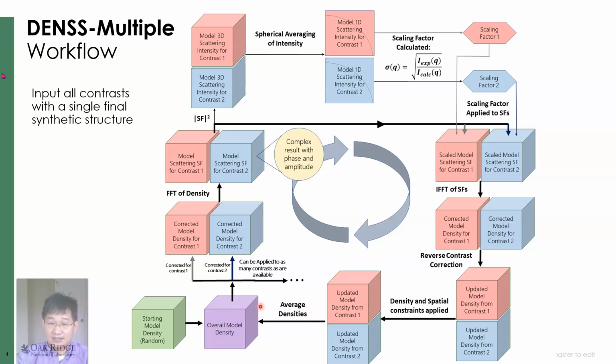And at the end, if the average chi-square value has no change from the previous average, for example 100 chi-squared, then the break condition is reached. So there is no improvement in the iterations, and we determine the algorithm has converged. That is where the iterative process stops.